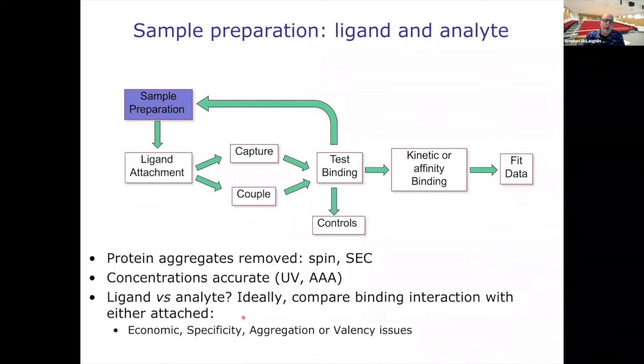For samples, you don't want to put on aggregates. Make sure they're nice and clean. You're going to measure kinetics or binding constants, so you need very, very accurate concentrations.